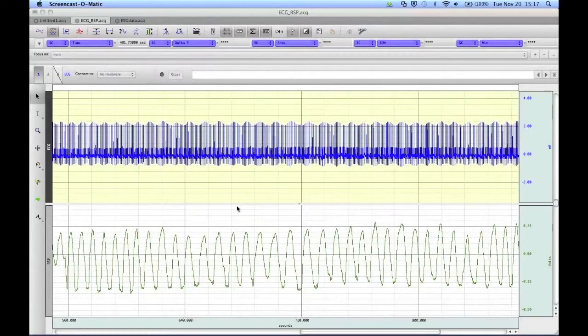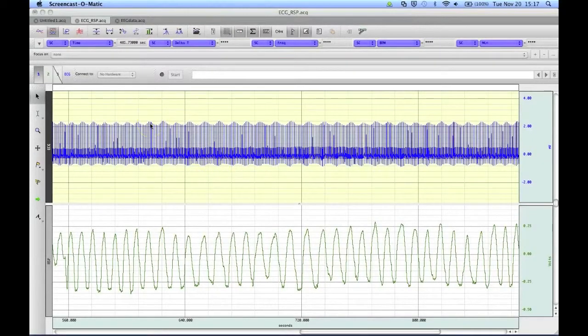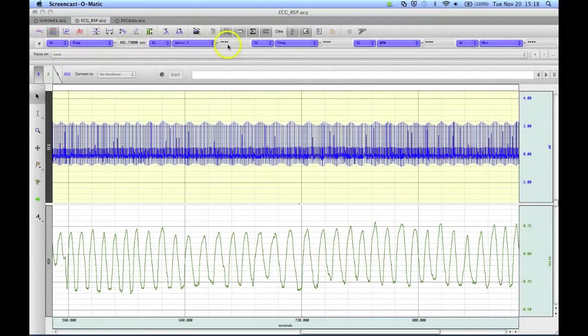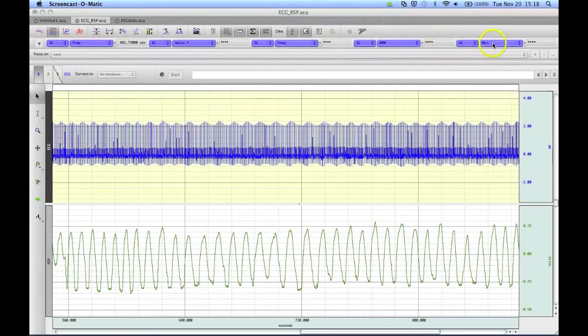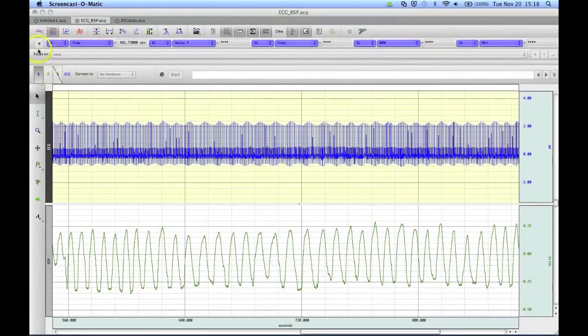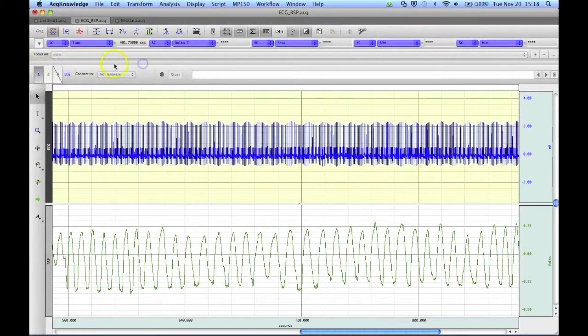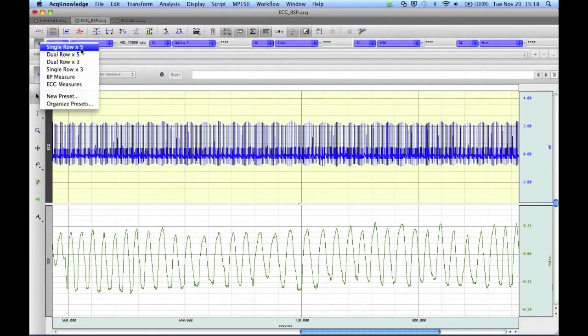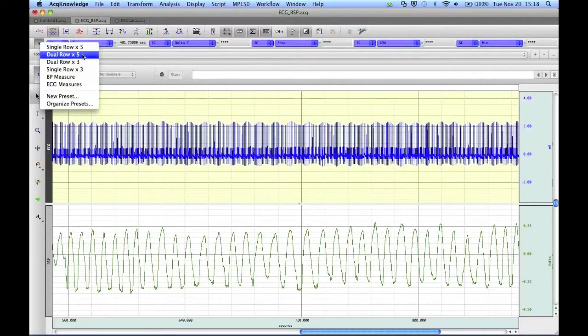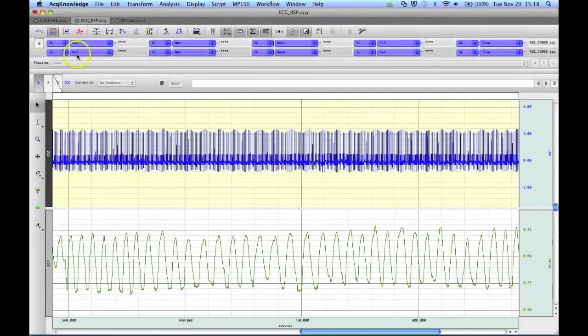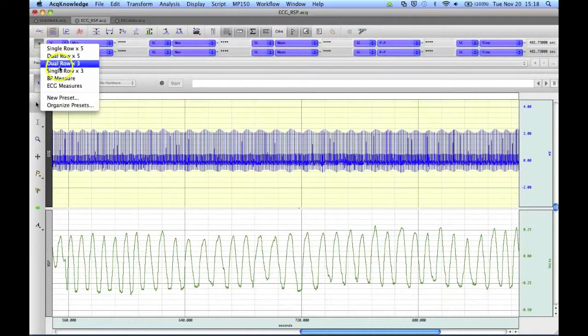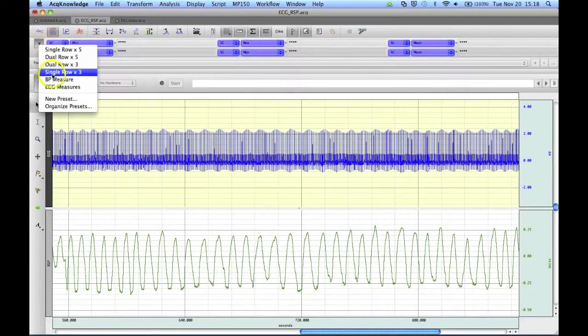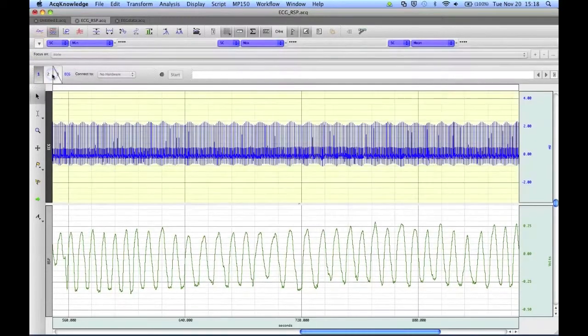Another type of preset that is new in Acknowledged version 4.3 is the Measurement Box preset. This allows you to set how many measurements you have going from left to right across your window, and how many rows you're going to have going up and down. If you click on the drop-down menu, you'll see some presets that I've already created, such as a single row of 5, dual row of 5, dual row of 3, and single row of 3.